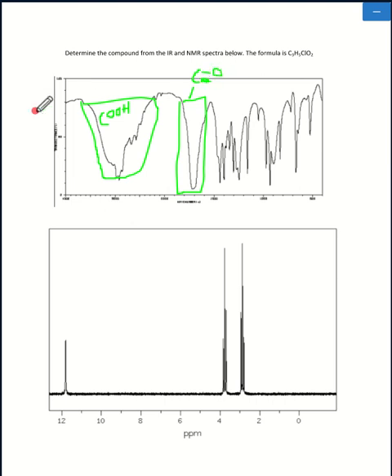Now, these guys right here, the NMR on the bottom, basically use this to determine the actual structure of your molecule based off of the N+1 rule. So however many hydrogen are on the carbon you're looking at, determine how many hydrogen would be nearby. And if you can't really determine, then draw some drafts of a chemical structure and see if they make sense.